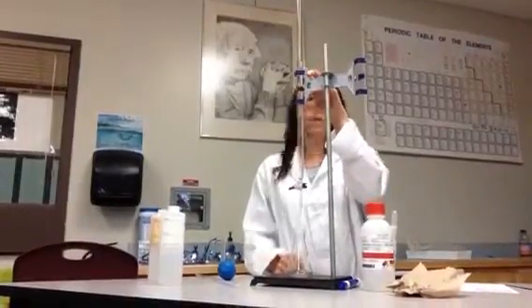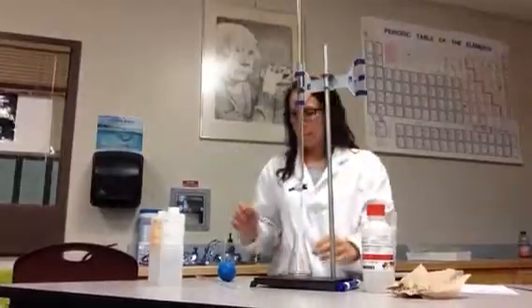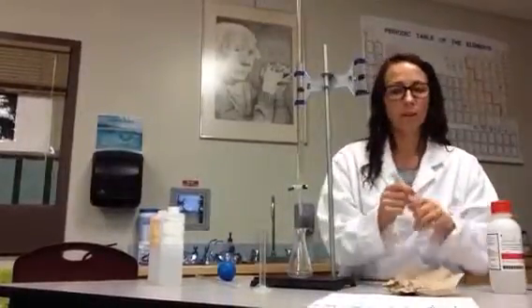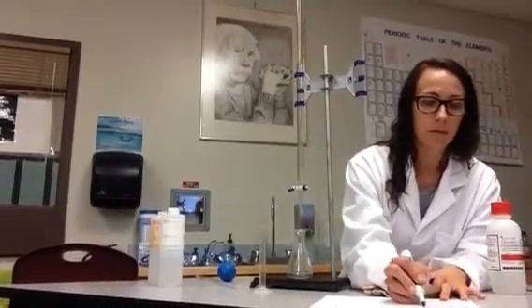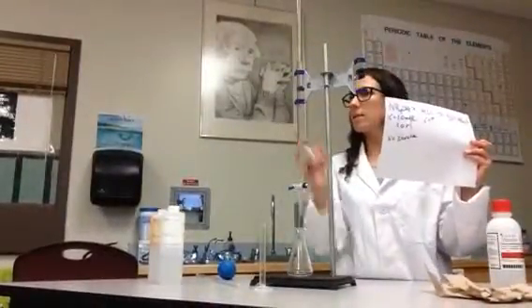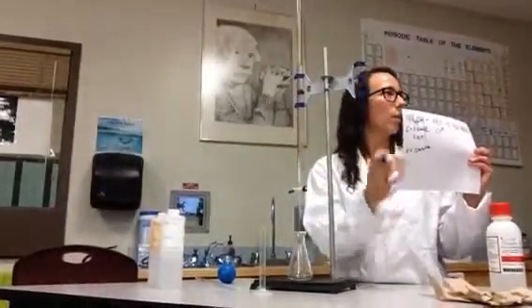In here is my acid. Now this is pretty exact actually, this burette. Not only can I measure out exactly how much has come out, but it's to 2 decimal places, which is nice. I'm going to need a volume of acid. Can you see that? So this volume here is coming out of the burette. Whatever volume it says when I'm finished is the volume that I'm going to use.